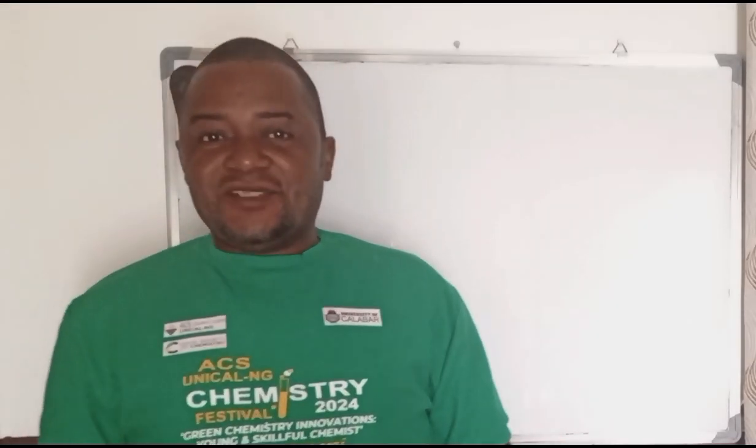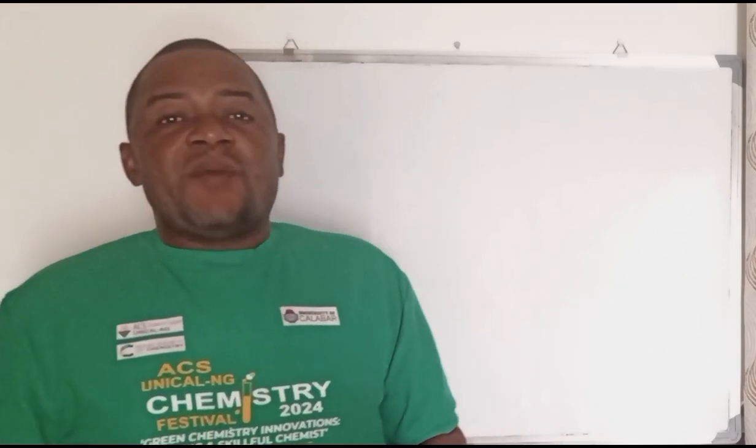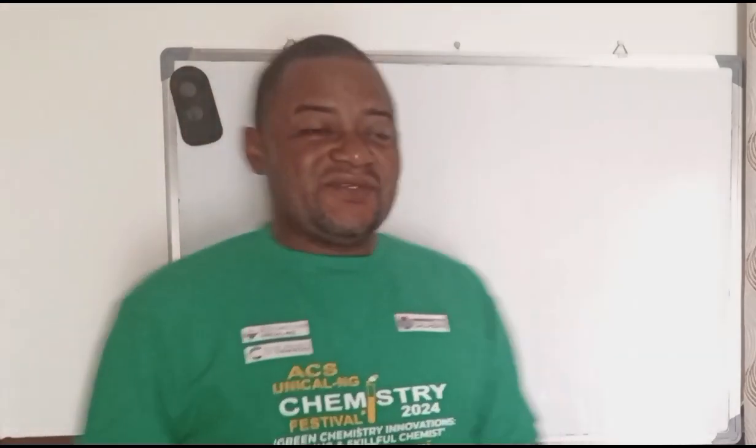Hello, your chemistry teacher here. Today, we are still going to continue with the laboratory. Remember that in our last class, we discussed how we can calculate percentage impurity from a given substance. Today, we're still going to look at the laboratory and see how we can prepare, let us say, dilution of standard solutions.